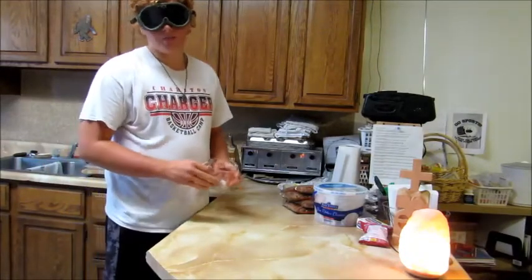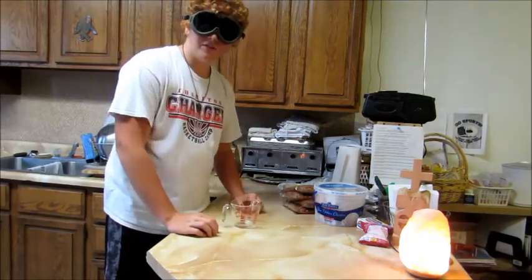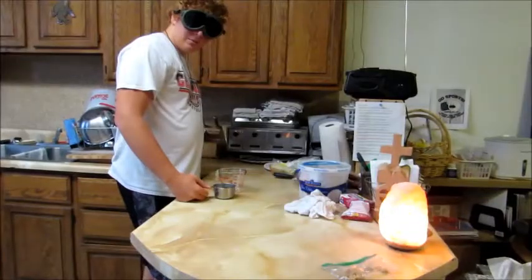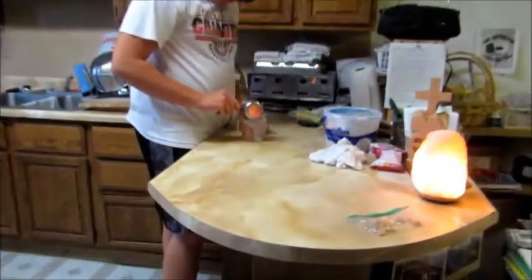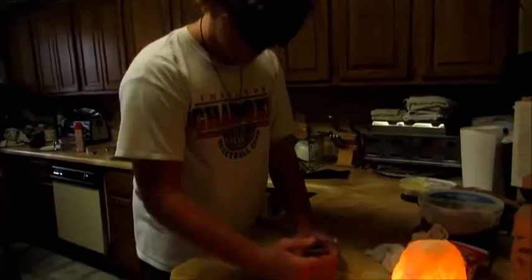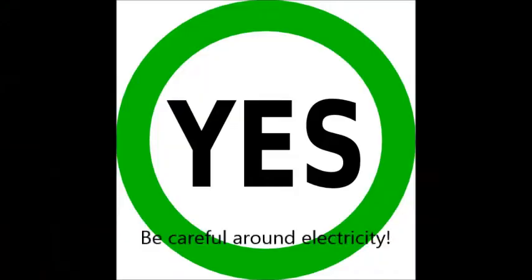Always inspect your glassware before you use it. Seems legit. I'm just gonna pour some chemicals into a glassware that I haven't checked. Oh, now there's water everywhere. There must have been a leak in the glass. Oh, there's a cable over here that's opened up. I'm not gonna operate over here.